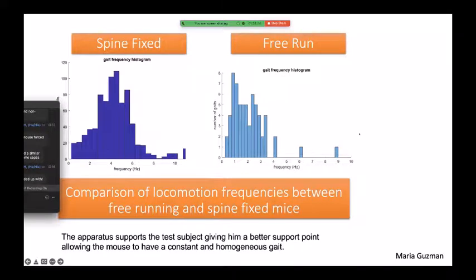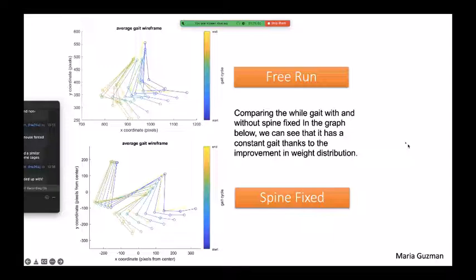And actually, the good thing about the flying saucer treadmill is that because of the way it's angled, gravity sort of pulls the mouse down, so it triggers the spinal cord circuits for the mice to voluntarily run. So they just constantly run and run and run until they get tired. And in addition to that, we tried angling the linear treadmill. That helped a bit, but the training paradigm was just what was holding us back.